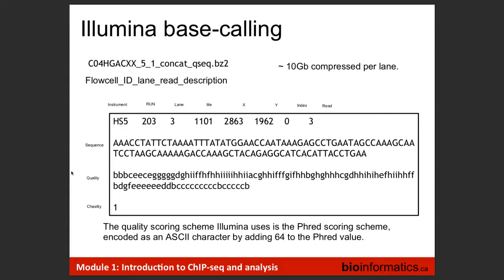Okay, in the last few minutes here, this is an intermediate file that I just wanted to show you, to give you a feel for how we get from the Illumina file into the FASTQ file. Let me break it down for you. Of course, the major component is the sequence string itself. That should be fairly self-evident. And then the base qualities, and the base qualities are here.